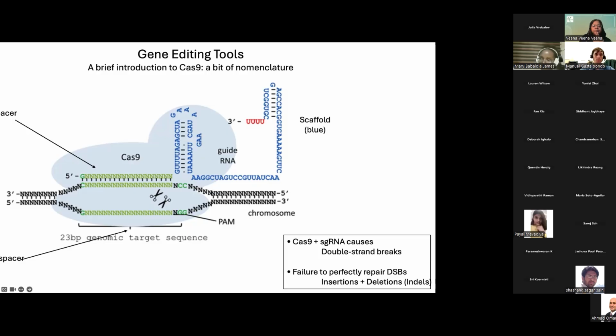So some programs give you the sequence of the gRNA for one strand, and then your PAM region is actually, if you put that gRNA as it is, on the opposite strand. That happens usually with the gRNAs that are in the opposite direction of the strand that you put in. Am I making myself clear? So based on this picture, this is what I'm confused about.